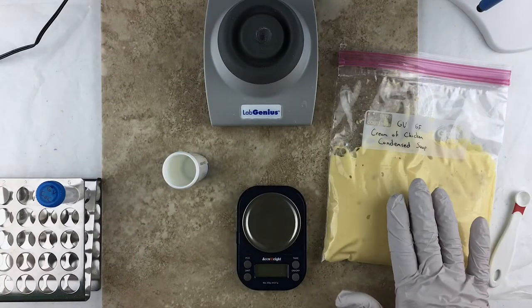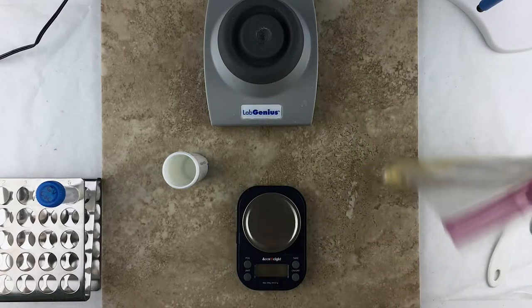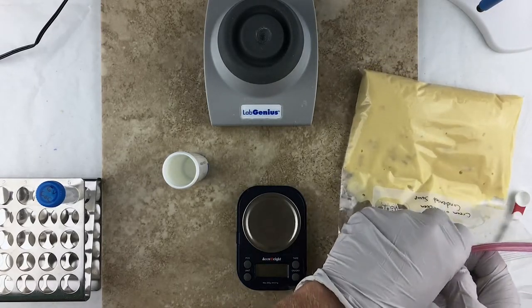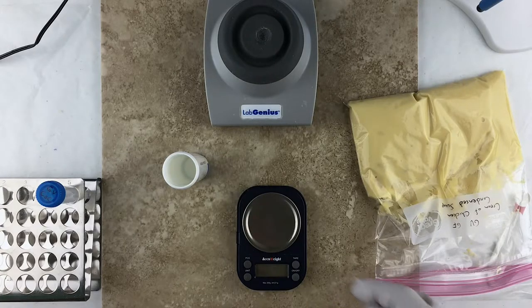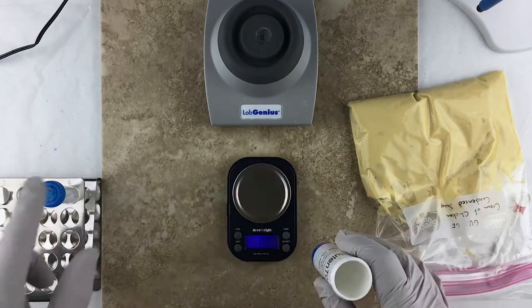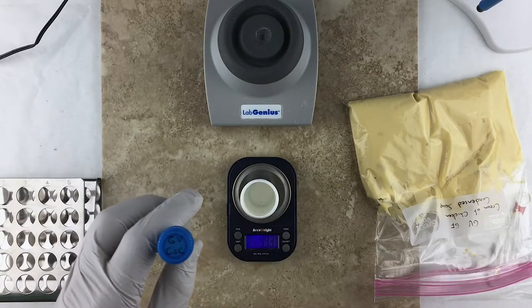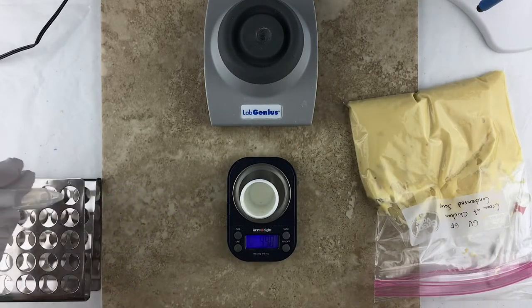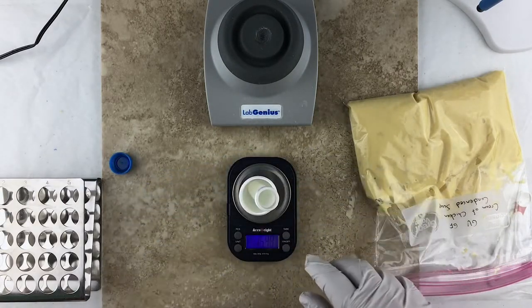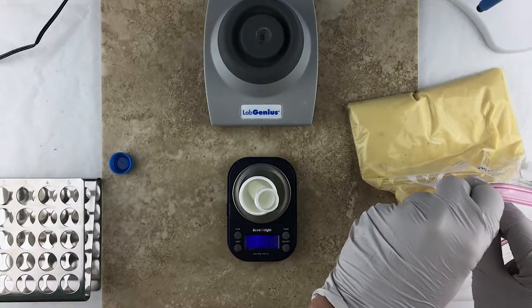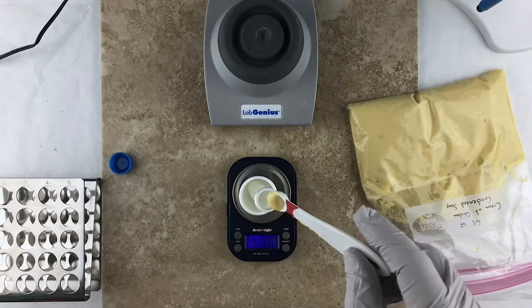So I've got the Great Value Gluten-Free Cream of Chicken Condensed Soup ready to begin the process of testing. The first step is we need to measure out one gram of the soup into this test tube right here. So I've got this test tube labeled GVCOC, Great Value Cream of Chicken. I'm going to put this empty tube on the scale here.